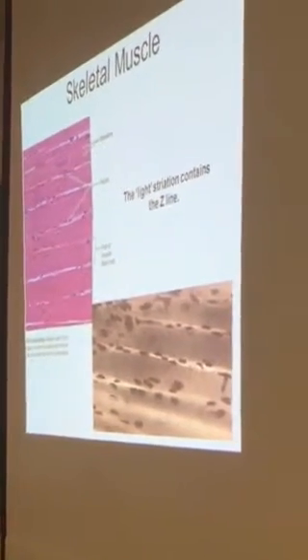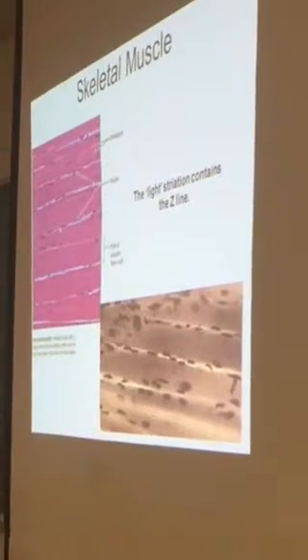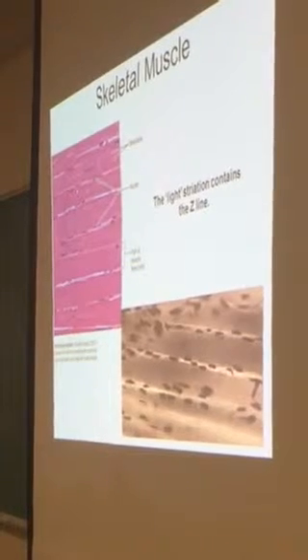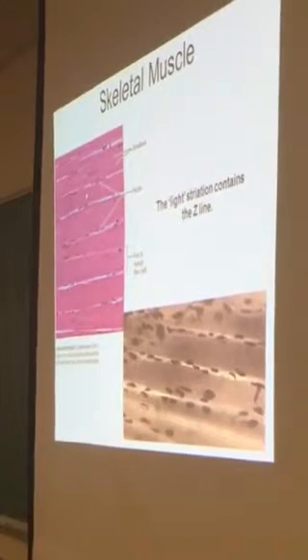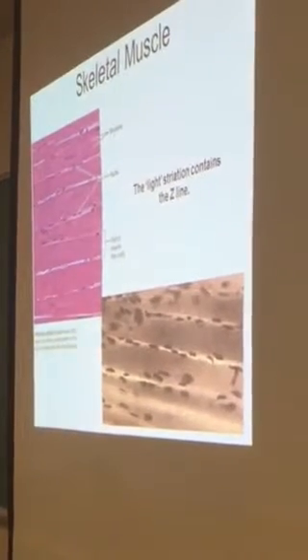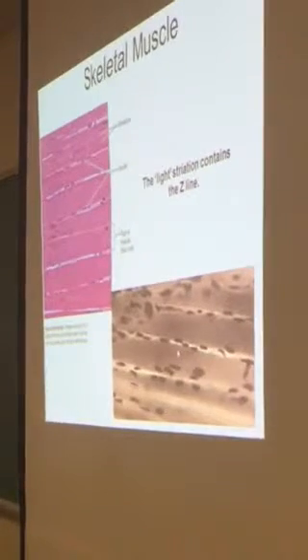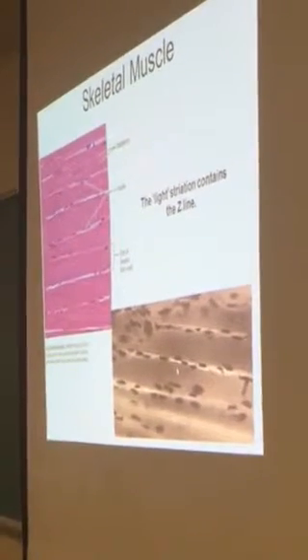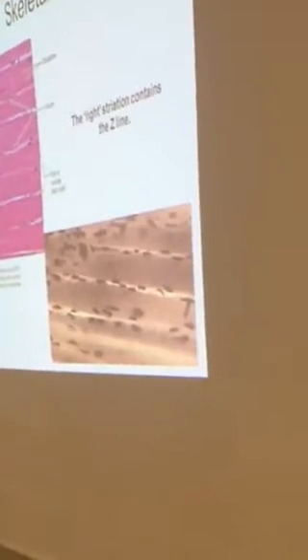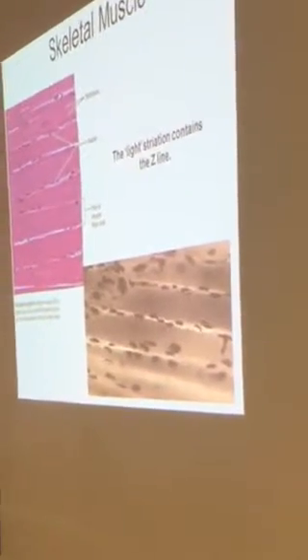Okay. If you look at the nuclei, they are usually on the periphery of the cells. You will find a few in the middle, but for the most part, this is very unlike smooth muscle. They're always pretty much towards the edges. This is also a different stain for skeletal muscle, and we have those back there. It is better to see the striations. So if you haven't looked at a black and white skeletal muscle slide, make sure you look at one.